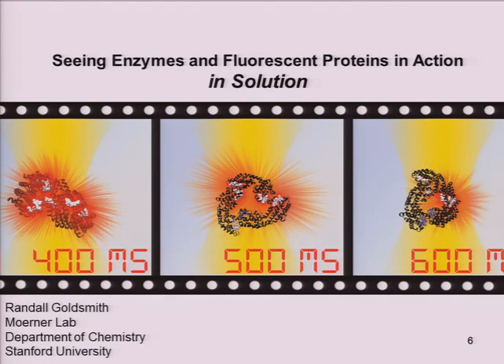And this is why we do single molecule measurements. And if you want to build in some of the things that Callie said earlier, if you want to see arrows spinning at different speeds corresponding to heterogeneity, right, this is the technique to do it. All right, what about single molecule measurements in solution? Why is that interesting or important?